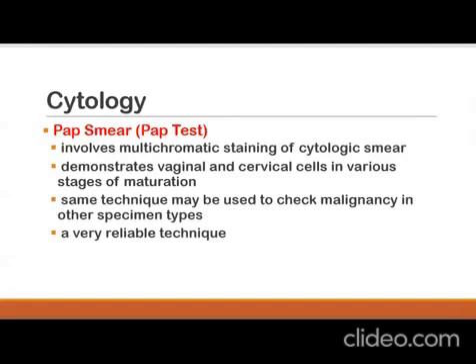Okay? So we have mentioned a while ago that this method is actually a good technique under gynecological cytology. But actually, class, aside from the vaginal smears or from the vaginal secretions, this technique could also be utilized in other types of specimens as well. Okay? So, any specimen po na nag-i-involve ng cells.